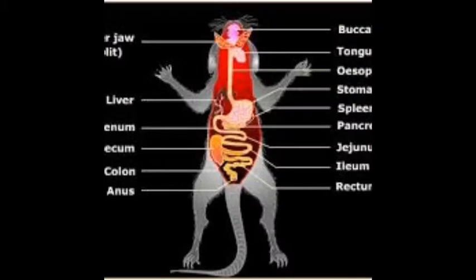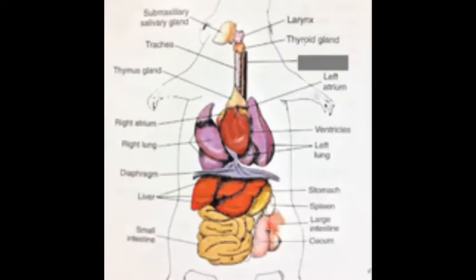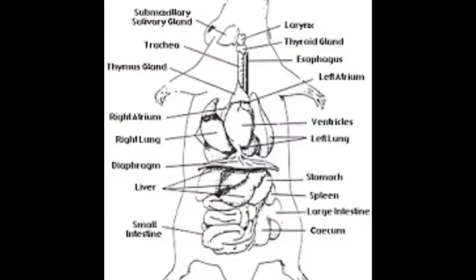A rat's digestive system compares to that of humans in 2 major ways. First, the rat does not have a gallbladder because they don't ingest fatty foods, which would make the gallbladder useless. Additionally, they have an enlarged large intestine called the cecum, which breaks down grains and seeds by using the bacteria inside the cecum, which breaks down cellulose. They are similar in the sense that they are made up of the mouth, esophagus, stomach, small and large intestine, rectum, and anus. Additionally, in both rats and humans, the digestive system plays the pivotal role of turning the food we ingest into the energy and nutrients that we need.